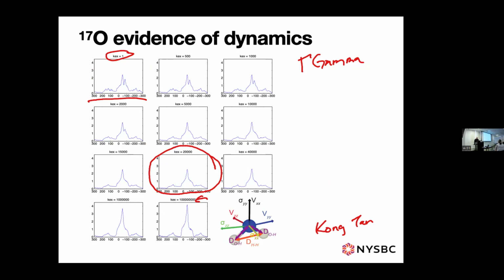I would assume that the hop doesn't completely average the dipole coupling. It might put you in a place where the dipole coupling is much narrower, or an intermediate exchange, in which case decoupling doesn't help. It's hard to get any traction out of just applying the RF. But then if you go all the way to the fast limit, when you're really warm, I think there's probably some remaining dipole coupling that's much weaker. What do you think? I can go over some of this.